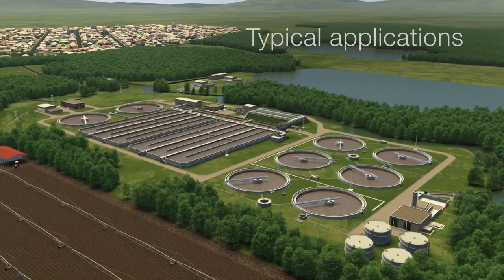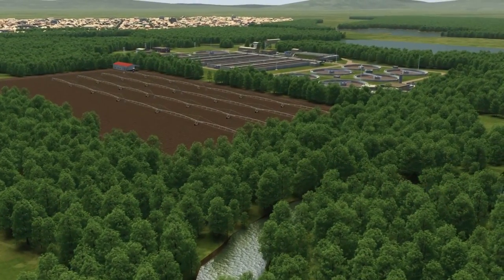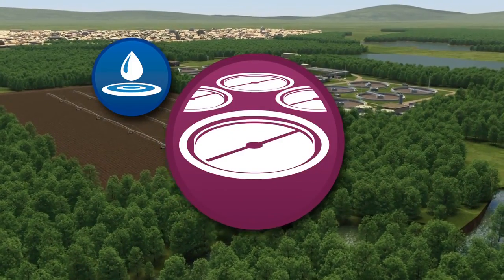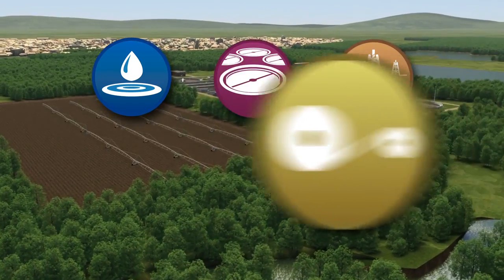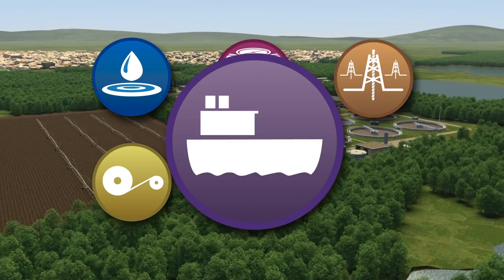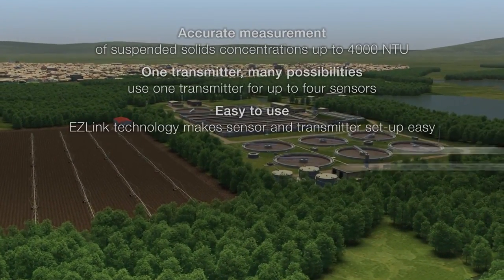In addition to monitoring municipal and industrial wastewater effluent, the ATS430 Turbidity and Suspended Solids System can be used in process control applications, including potable water treatment, municipal and industrial wastewater treatment, produced and flowback water treatment for fracking, pulp and paper process control, mining and refining operations, and in marine applications. Enjoy the benefits of accurate, reliable turbidity monitoring today.